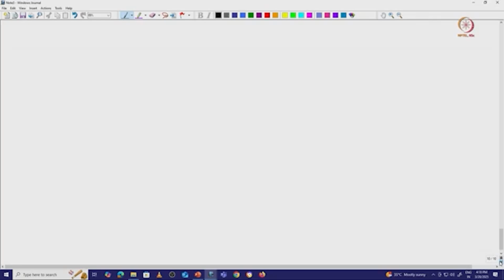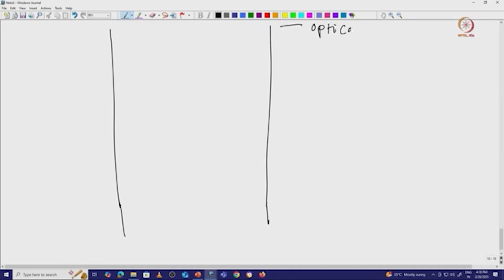So if we come again, it will be better to draw the optical axis at the beginning. I am not talking about C1 or C2 changes now, because we already discussed that. So this is our optical axis. From this optical axis, the first ray will come like that, then there will be a crossover point here.